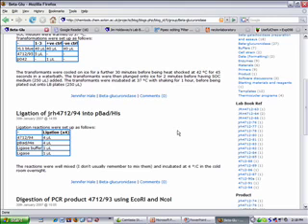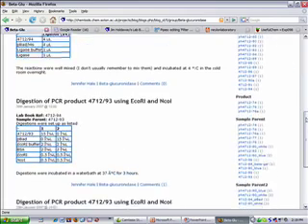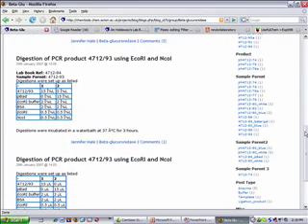But the problem was, if we do an experiment, we use a material to generate another material, we do something to it. We want to link those two things together. How do we know what was the material that went into an experiment? And so the easy way to do that, we thought, was to have this thing called a sample parent. So this is a metadata that's attached to each post.